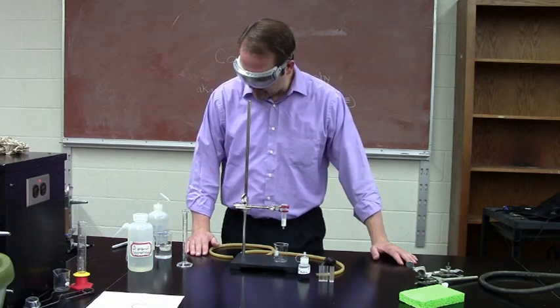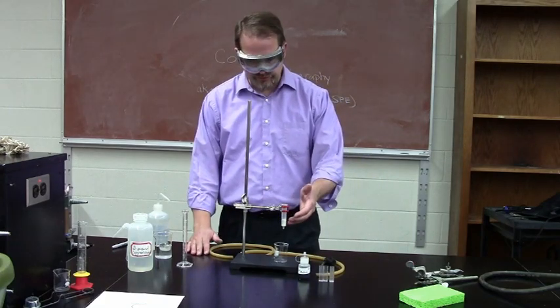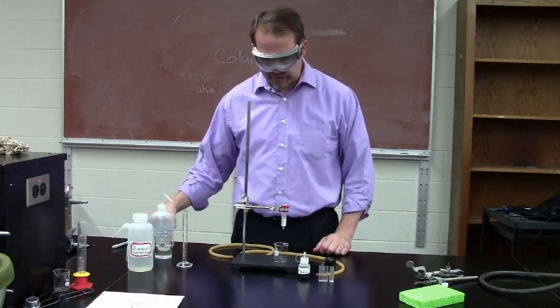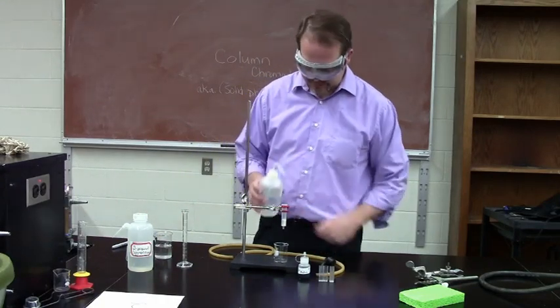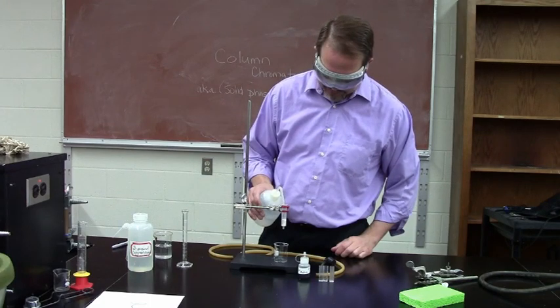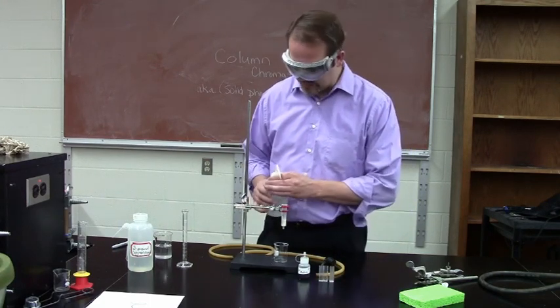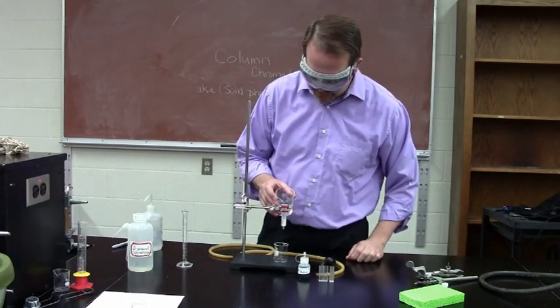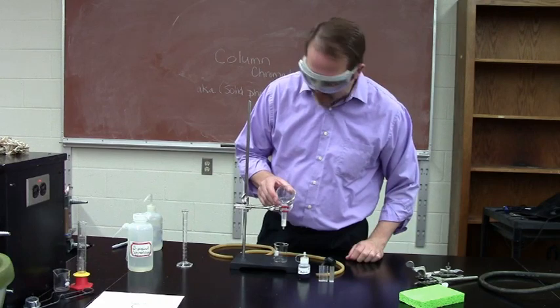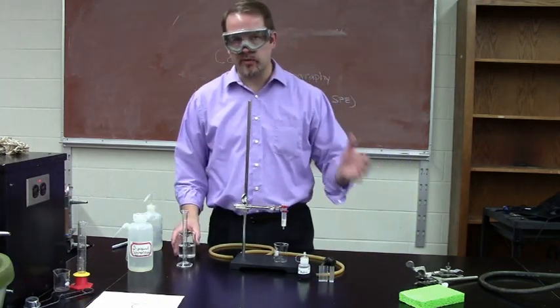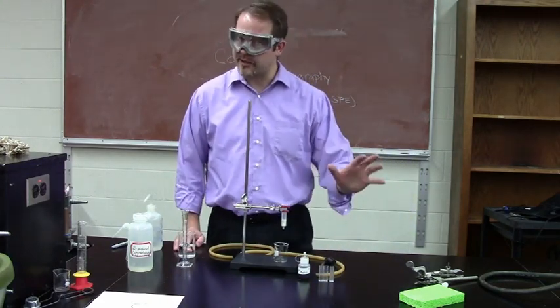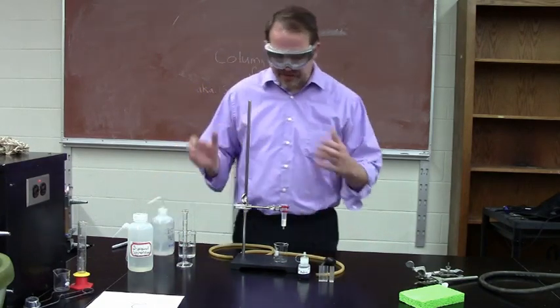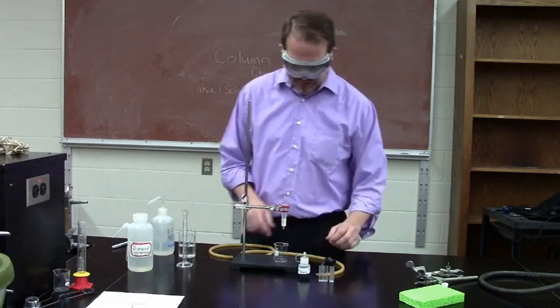To get started, you need to condition your solid phase extraction, or your column with this material, and you can do that with some deionized water or tap water. We're finding actually that the polarity of water changes whether you're using tap water, which has ions in it making it a little bit more polar, or using deionized water, which the ions have been removed. They actually have different polarity. So we're going to use a little tap water to get this going.